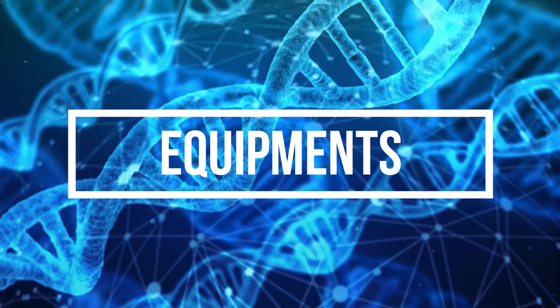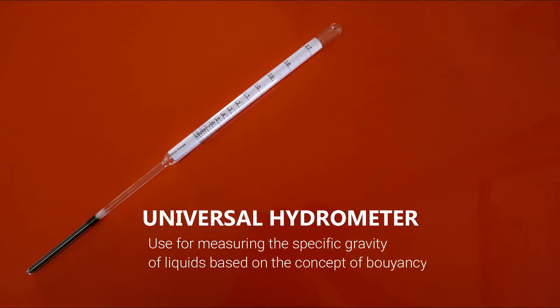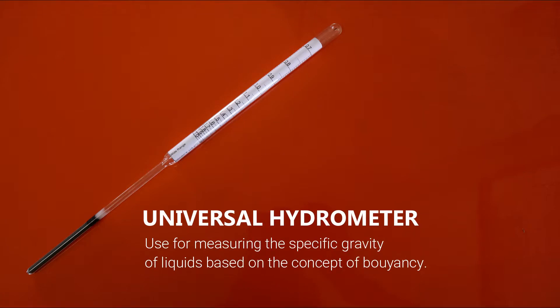For the equipments required, we need a universal hydrometer. It is an instrument used for measuring the specific gravity of liquids based on the concept of buoyancy.